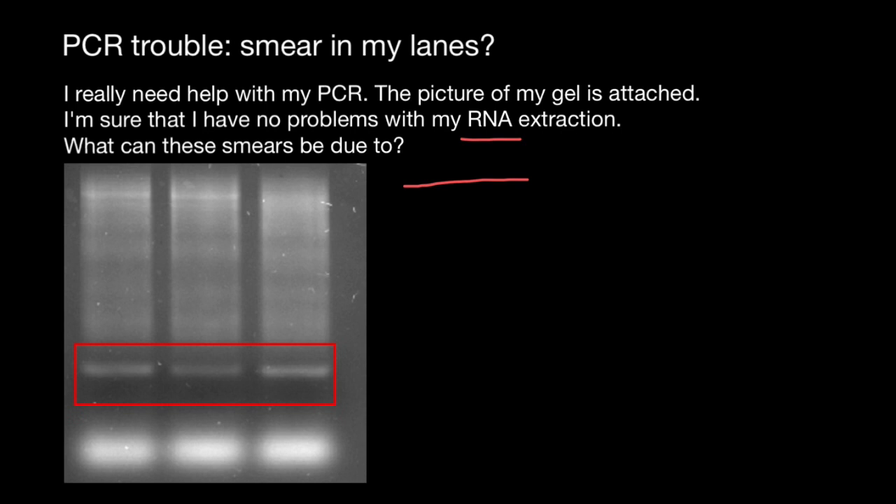Imagine this is one primer and here is another primer. Of course, each primer has a three-prime end and a five-prime end, and this one also has a three-prime end and a five-prime end. With the blue color I show hydrogen bonding — poorly designed primers may anneal. And during the PCR cycle, the polymerase may extend each strand.